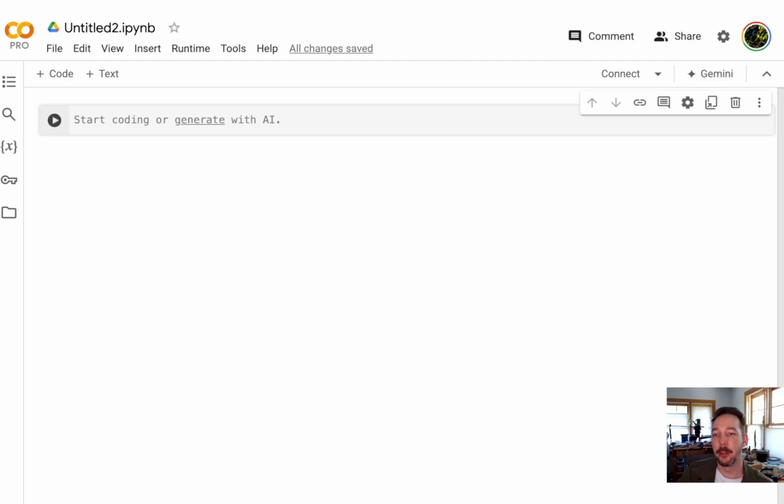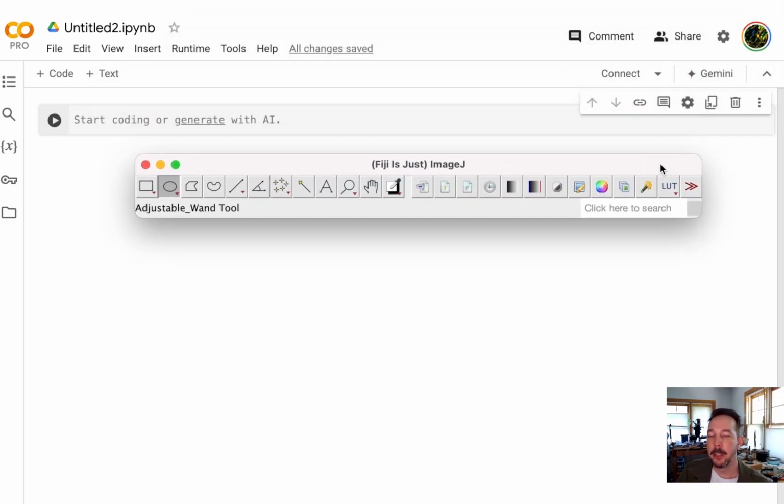In terms of image analysis, I think Python is an essential tool alongside ImageJ. I think ImageJ, or Fiji, is fantastic for viewing images, for doing small tasks. And it's great because you get a visual feedback on everything that you're doing. But once you refine what you intend to do, whether it's processing a large number of images or using these deep learning tools, Python is a much better solution because it's more efficient. It allows you to use state-of-the-art deep learning tools very easily.